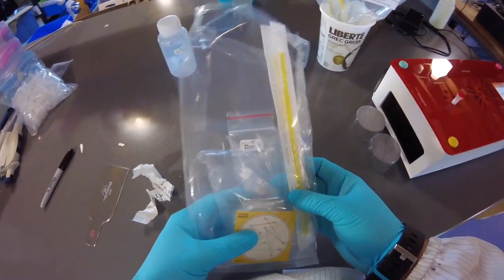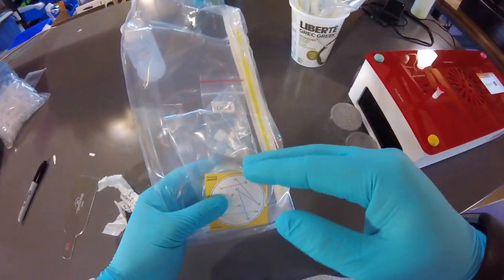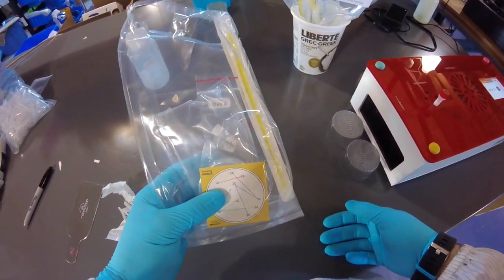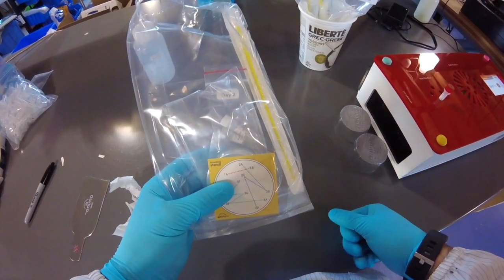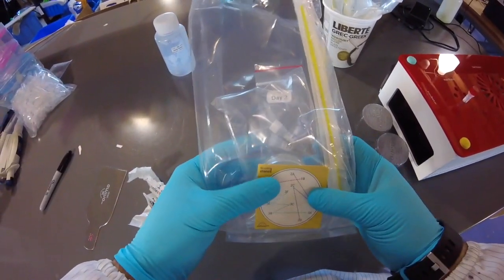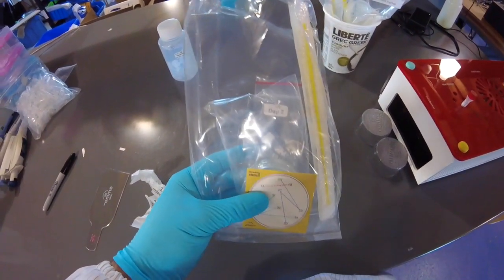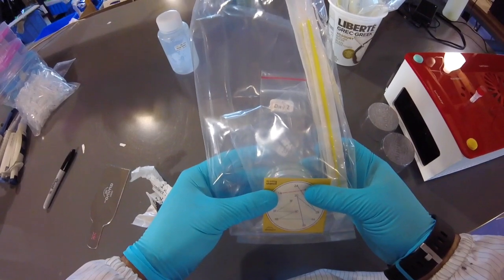So again, tomorrow we're going to be taking our recovered cells, we're going to be putting them onto these Petri dishes, or one of the Petri dishes, along with a positive control, and then that's called plating, and then we're going to incubate them, and on day 4 we should have some engineered cells where you've added a DNA plasmid into the cells, and that DNA plasmid is expressing genes, notably that are going to create some colorful pigments. Okay?